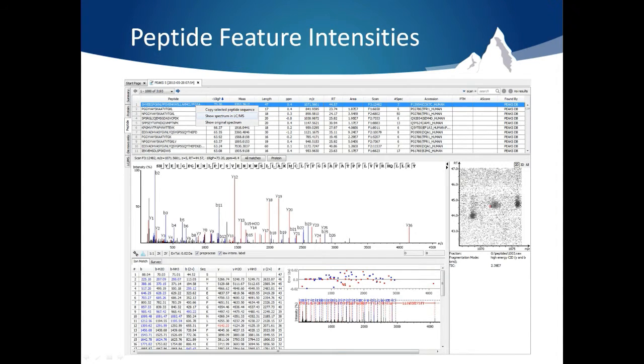If you'd like to validate the link between identified peptides and peptide features it's quite easy to do. Right click on a peptide in the peptide table and select show spectrum in LC-MS.